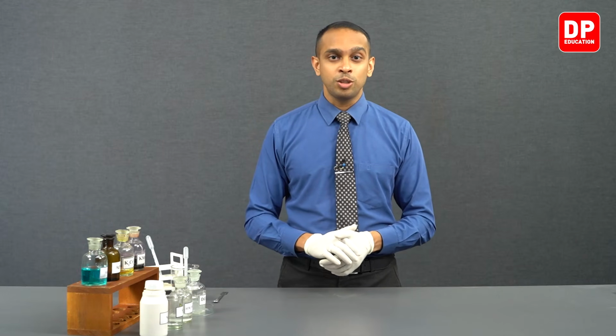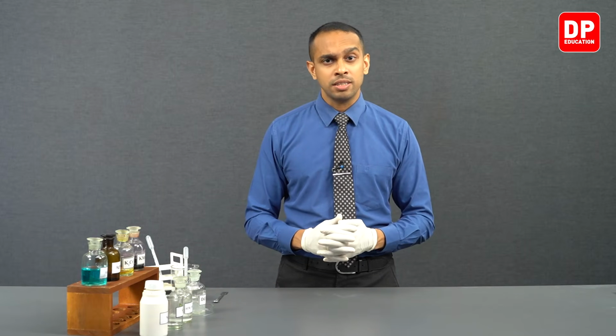When we added hydrochloric acid to sodium sulfide, we observed the formation of a pungent smelling gas, and this gas is hydrogen sulfide. Hydrogen sulfide is an irritant gas and it has a very characteristic smell of rotten eggs. So the formation of hydrogen sulfide is a confirmation for the presence of sulfide ions.